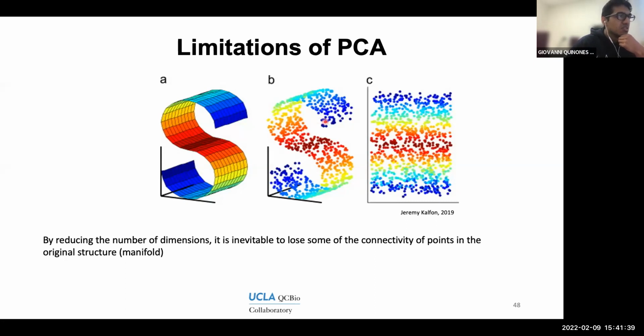So you see your dark blue dots all the way at the top and bottom of the plot. In the middle of the S, we have this dark red, which are now in the middle of the plot. And it kind of looks like it's doing its job, right? You can consider one thing, though, that is not quite represented here.